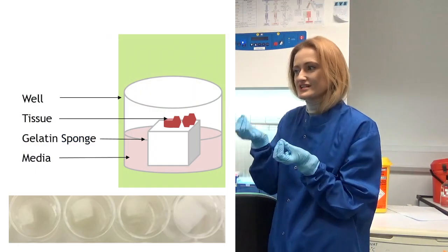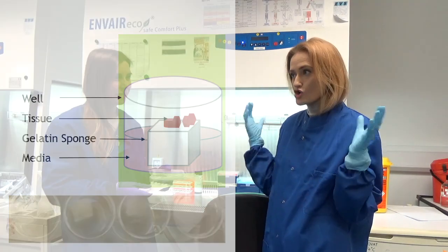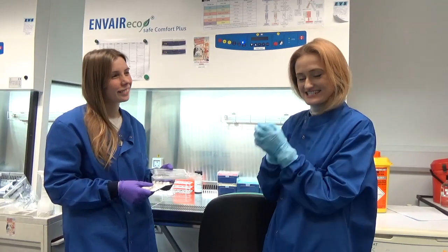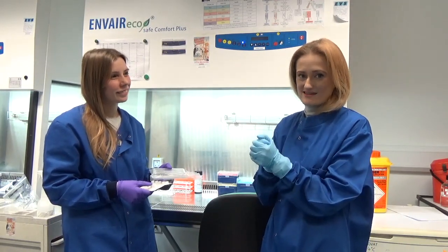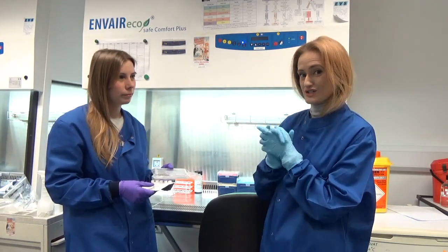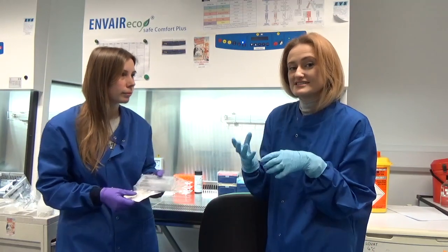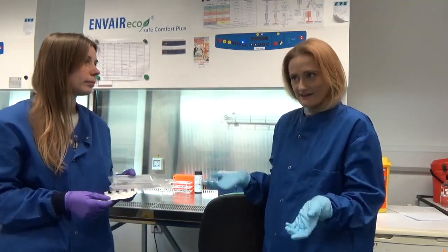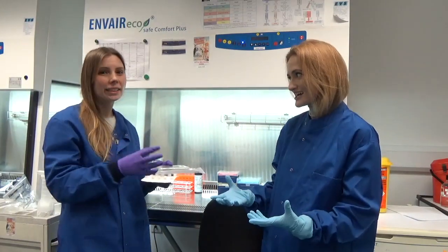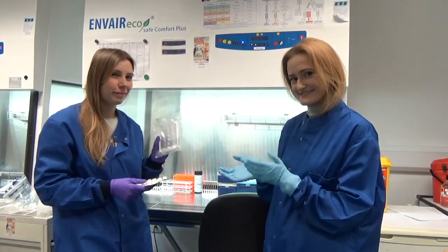So this is tissue that is straight out of a patient. I haven't dissociated it. It's like the full real Christmas tree, not a plastic one. It's the exact tumour, the exact way that it was in the body. We keep it alive for a few days, and then we can use that to test new drugs and therapies. It's pretty good, but again, although it does have some blood and some immune cells, it's not in a living body, so it doesn't have a blood system and an immune system functioning. But it's as close as we're really going to get in a plastic environment.